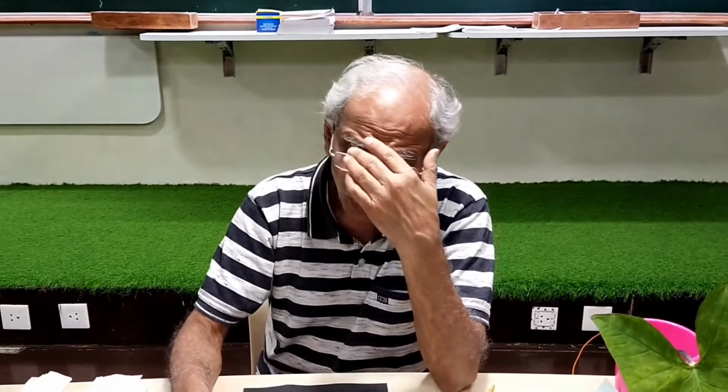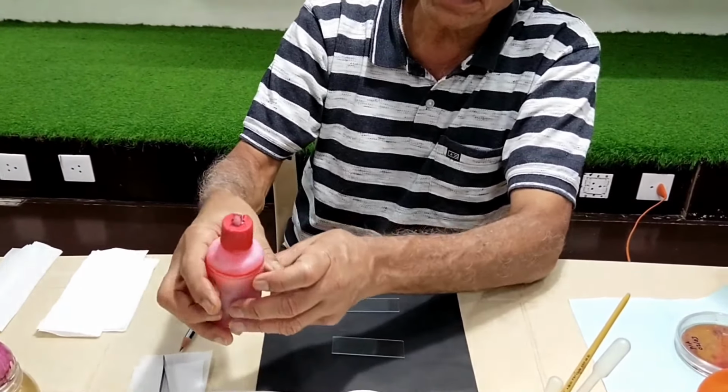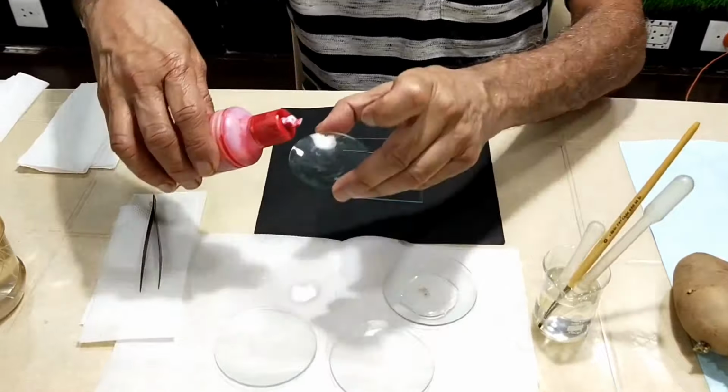When the nucleus is to be stained, you have to use a basic stain, because the nucleus is acidic, there is nucleic acid, and therefore you require a basic stain. So acetocarmine is basic and hematoxylin is basic, and they will stain the nucleus specifically. Eosin is an acidic stain, and eosin will stain the basic compounds in the cytoplasm. Usually it's a generalized stain. So I'm just taking a few drops of the eosin here in this watch glass.